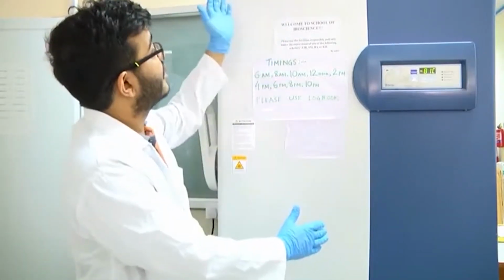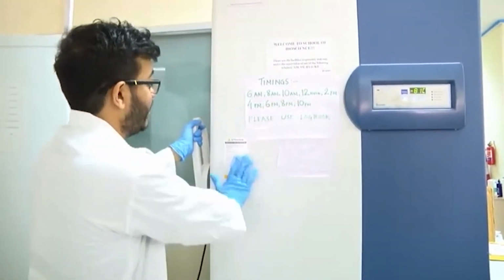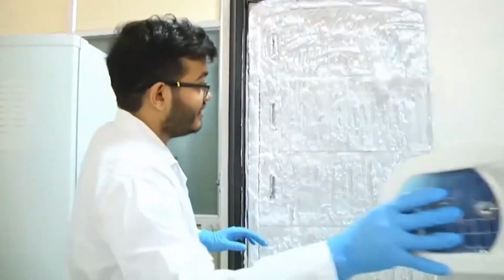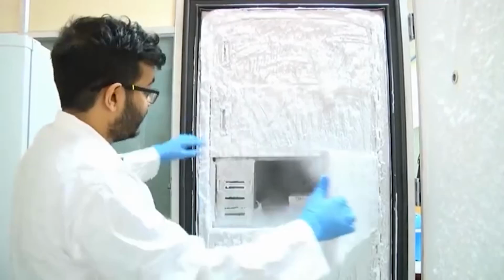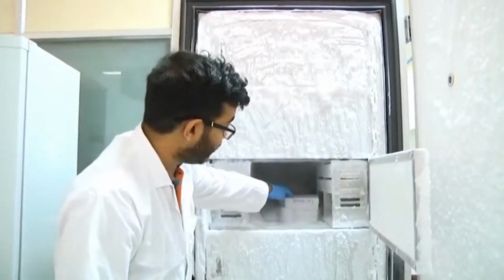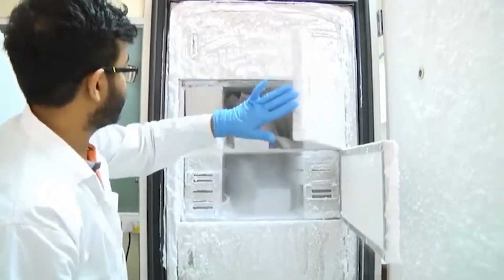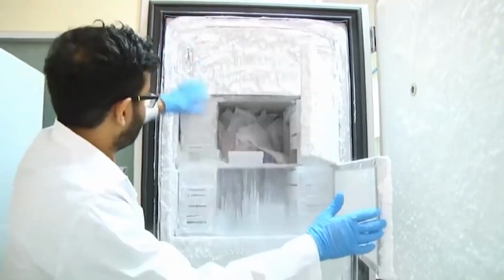This is one of our minus 80 degree centigrade freezers in our laboratory. I will just open it once, and see, it is covered in ice. We have DH5 alpha boxes here, and different plates containing different types of cell stocks, and all these are metal.